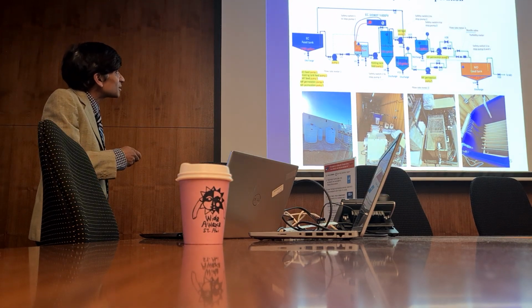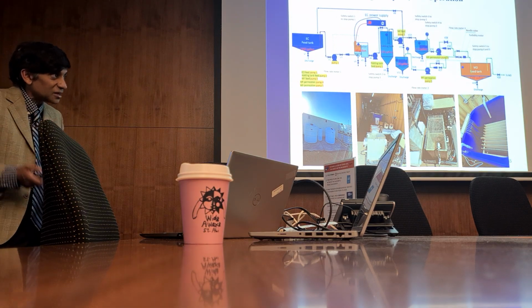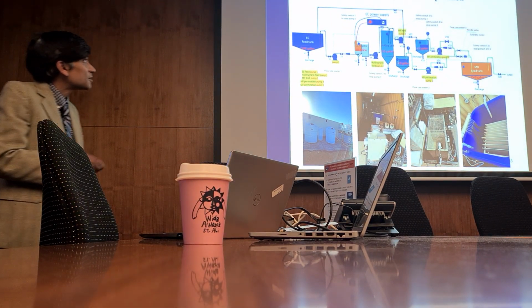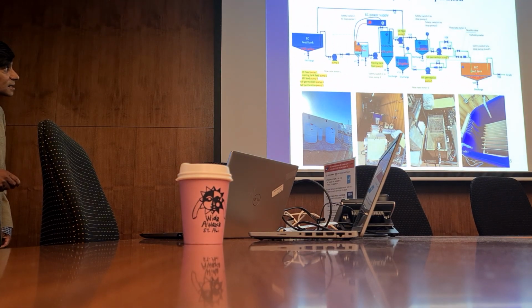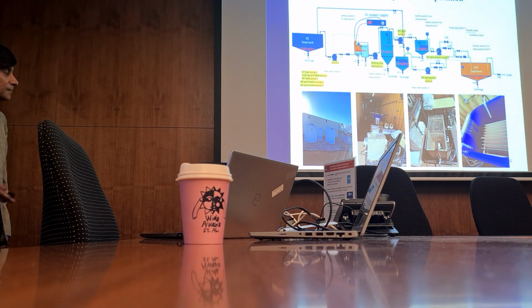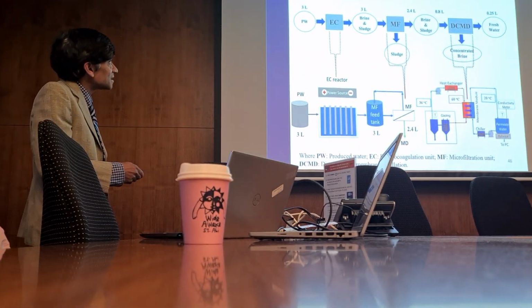We also needed a way to clean the electrodes because, of course, it's a corrosion process, right? You're destroying the electrodes, you've got to replace them. And so this is what we ran, and it was run for about a week and ran successfully. From our perspective, success meant that the membrane distillation process ran without fouling the membrane. Okay? And in the last 2 minutes left, so this is the process again schematically.